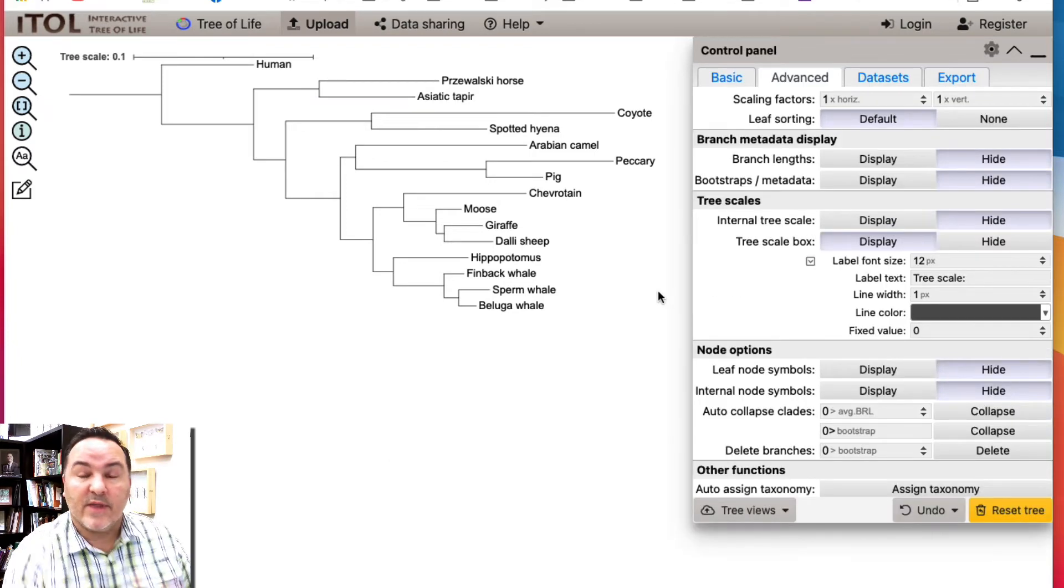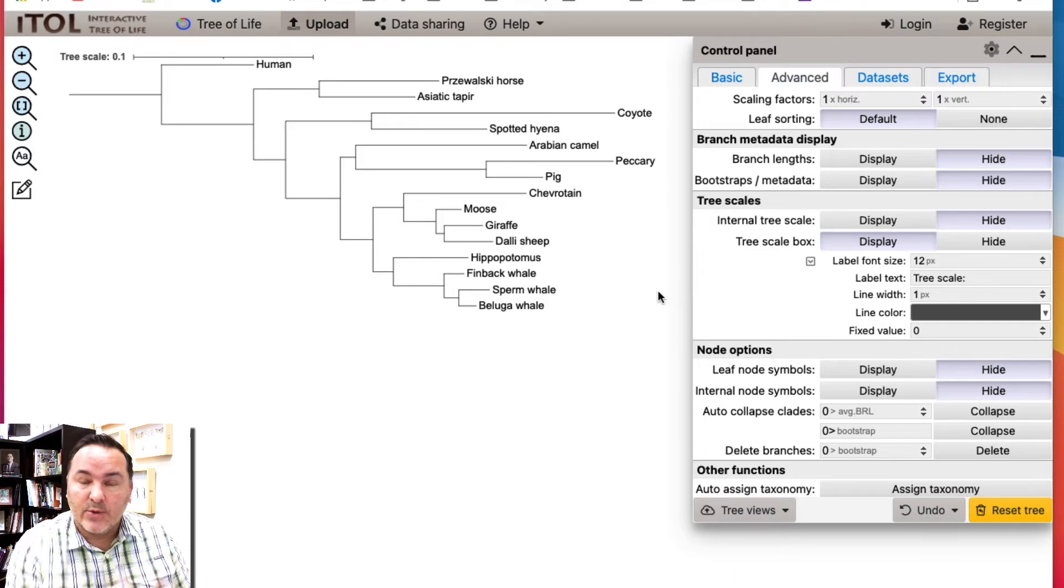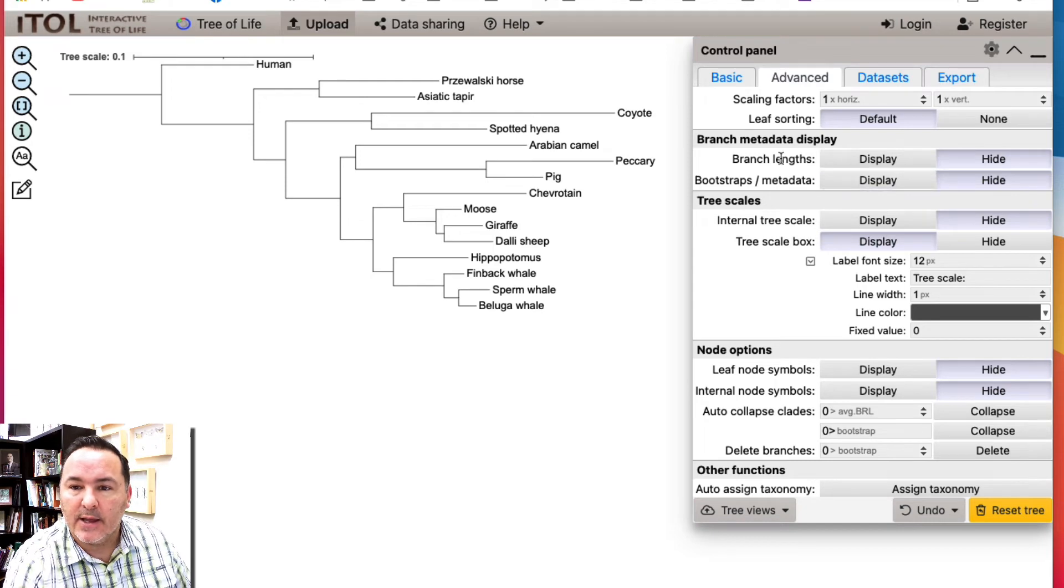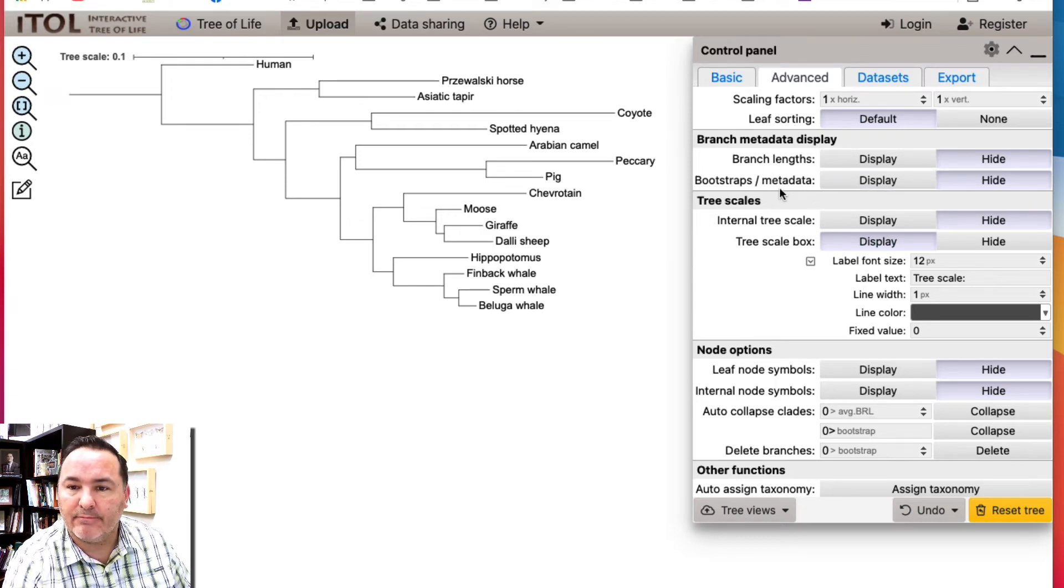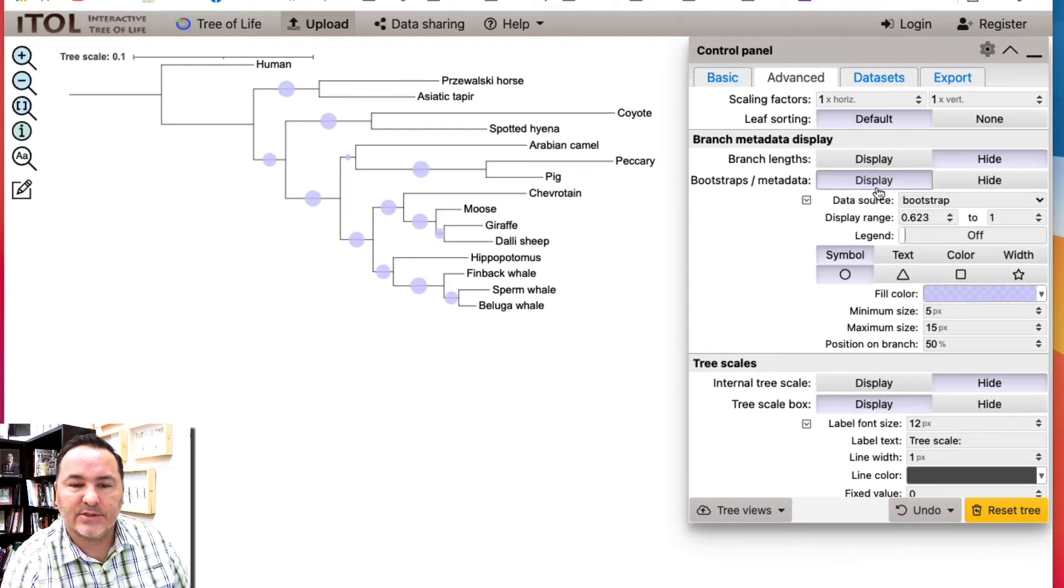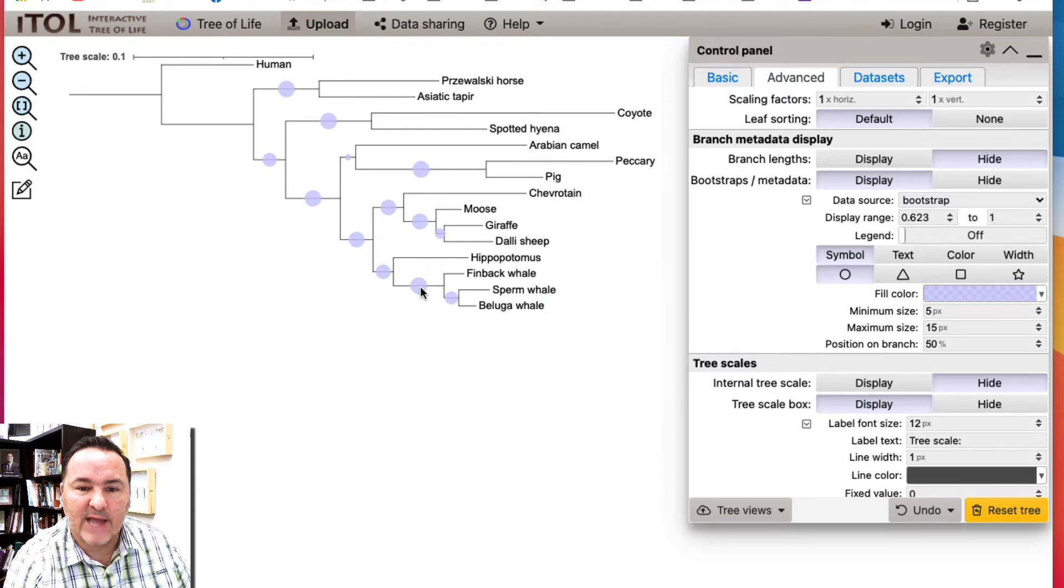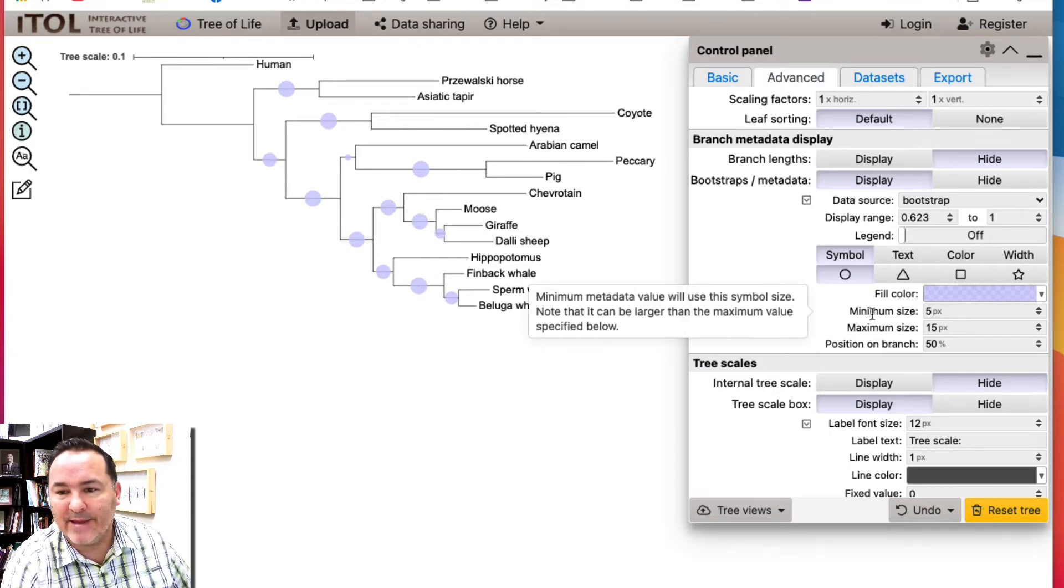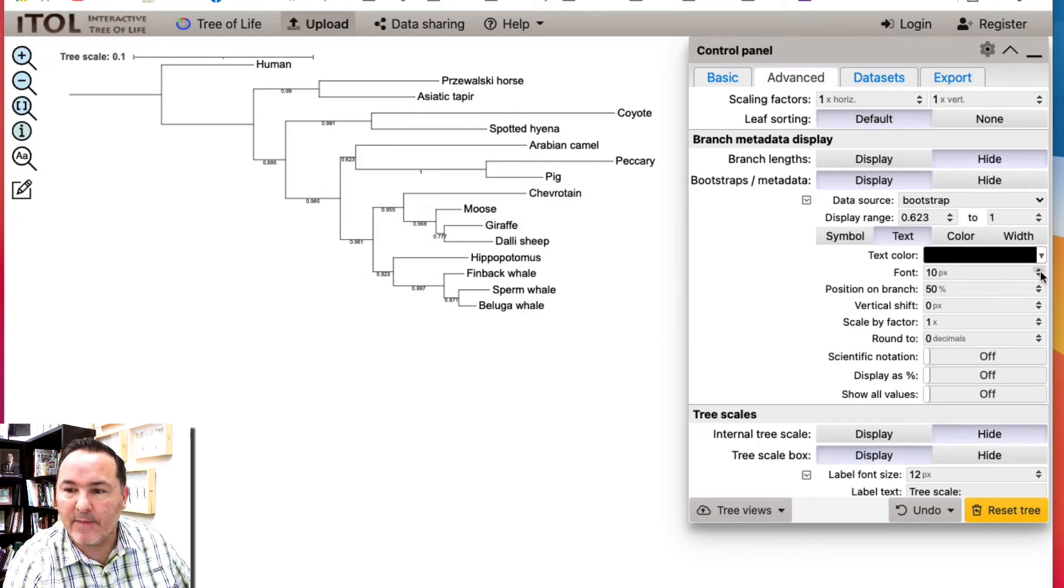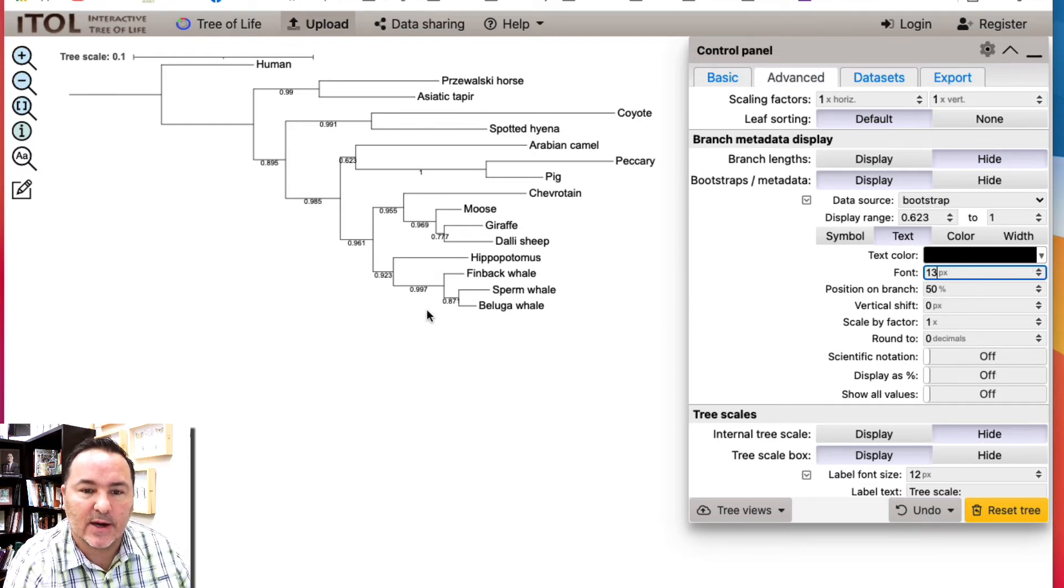The analysis that we used also did do a quick nodal support analysis. So you got some bootstrap data and that's right here in this bootstrap option. You can push display. Now the original thing it does is it's just displaying it by the size here of the circles, but maybe you don't like that. Maybe you want it to actually just be text. So you can make it be the text and maybe I want my font a little bit bigger so I can actually read what those values are.